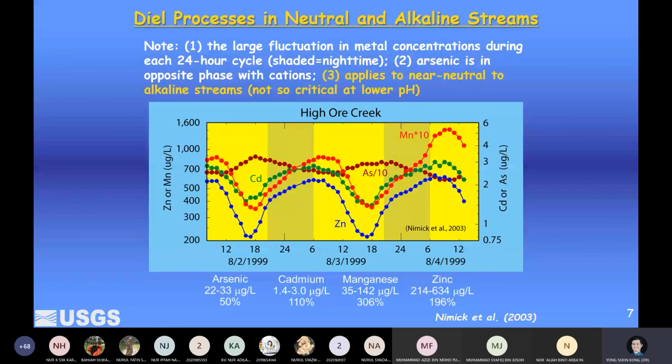Okay, so here we have one inorganic non-metal, and it is the first one, arsenic. Arsenic is not a metal, for your information. It's a metalloid. So in this case, if you want to analyze this one, then you're going to sample this one last.